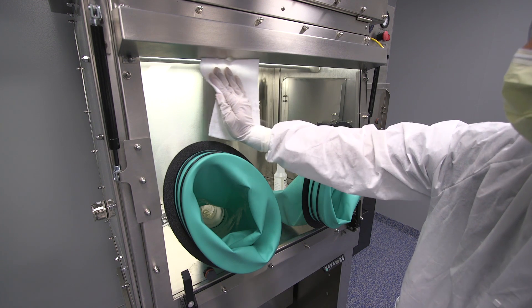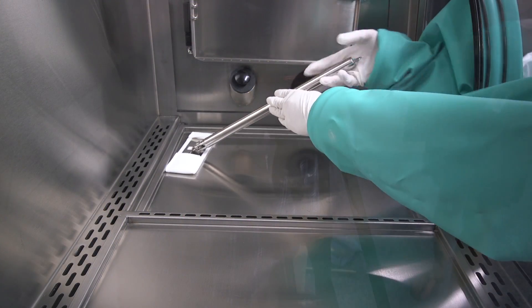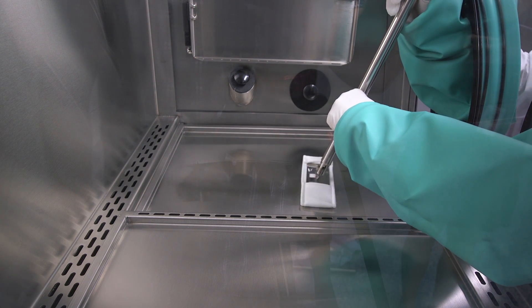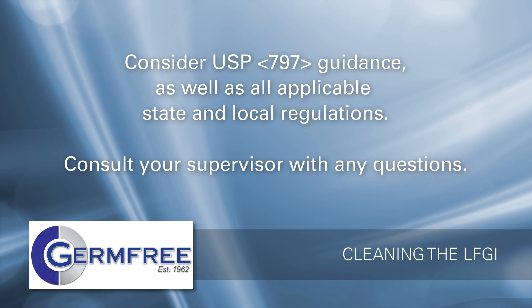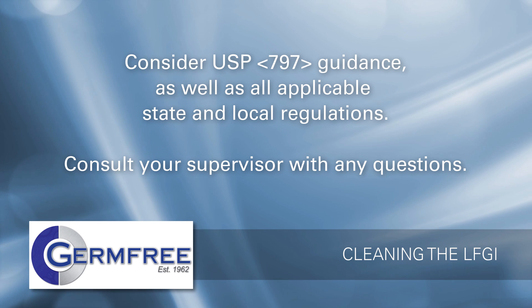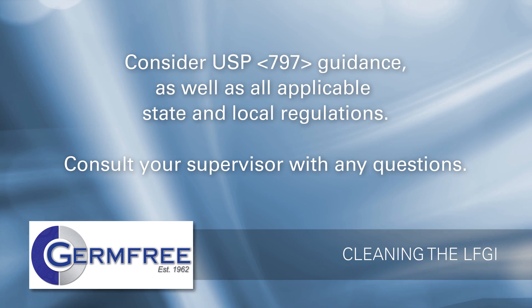Because of the critical nature of the products that will be made in the LFGI, a thorough cleaning is needed before the unit is put into service and regularly as required by your facility's SOPs. This video will address both the rigorous cleaning and a lighter cleaning to be performed between preparations. Your organization's cleaning and disinfection requirements may require work practices that are different than the general guidance in this video. Germ-free recommends considering USP 797 guidance as well as all applicable state and local regulations. Consult your supervisor with any questions you may have.